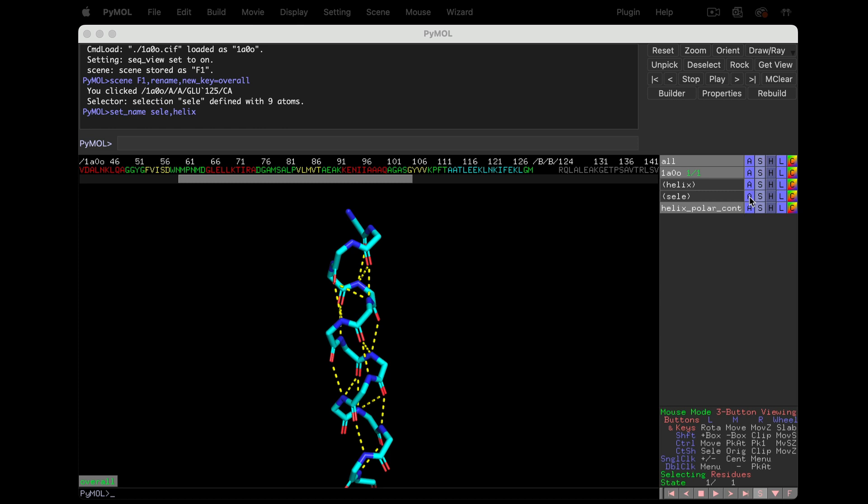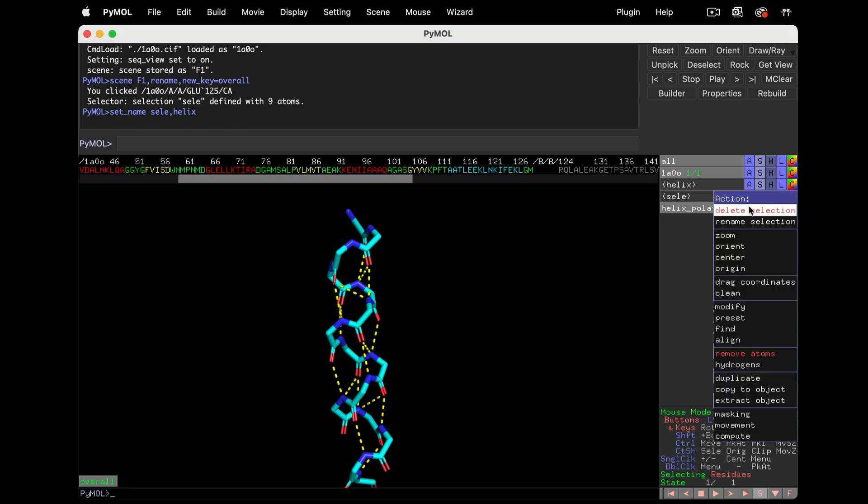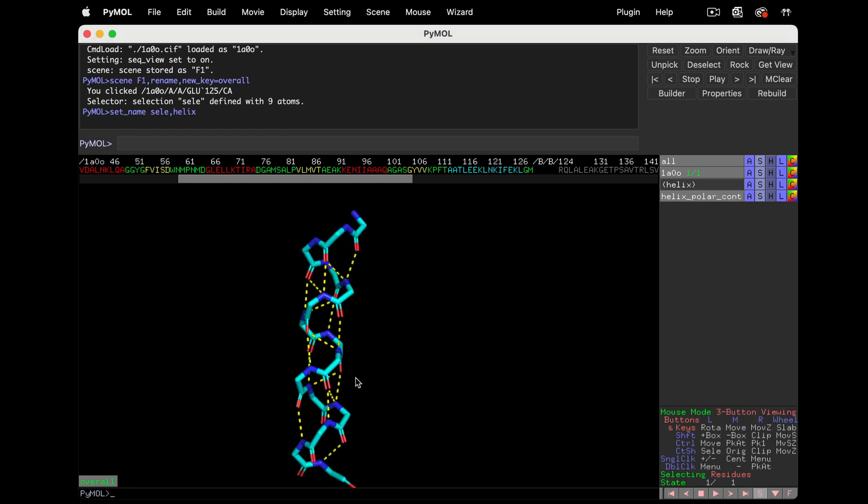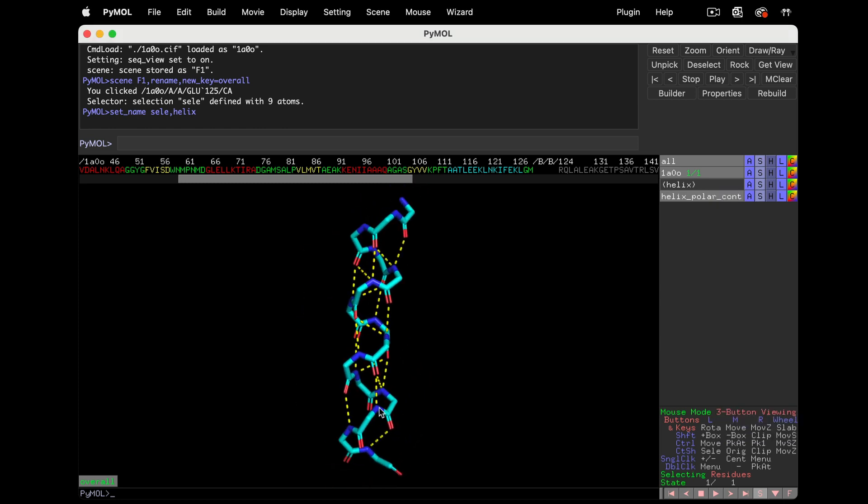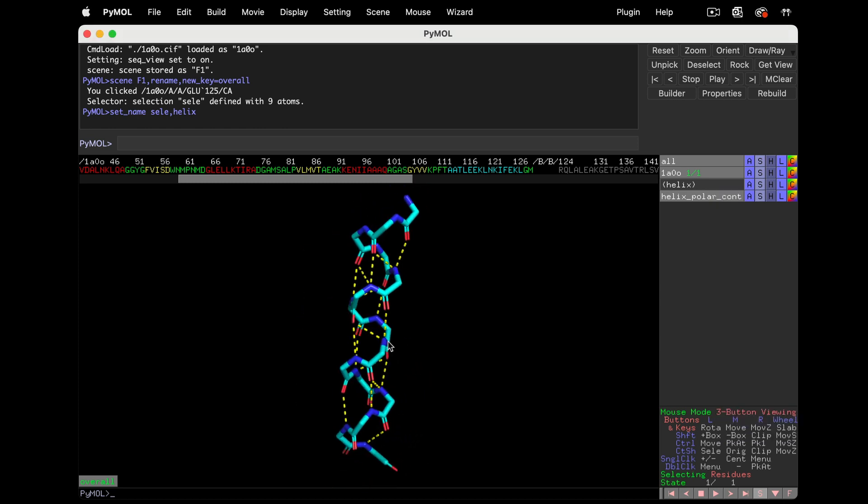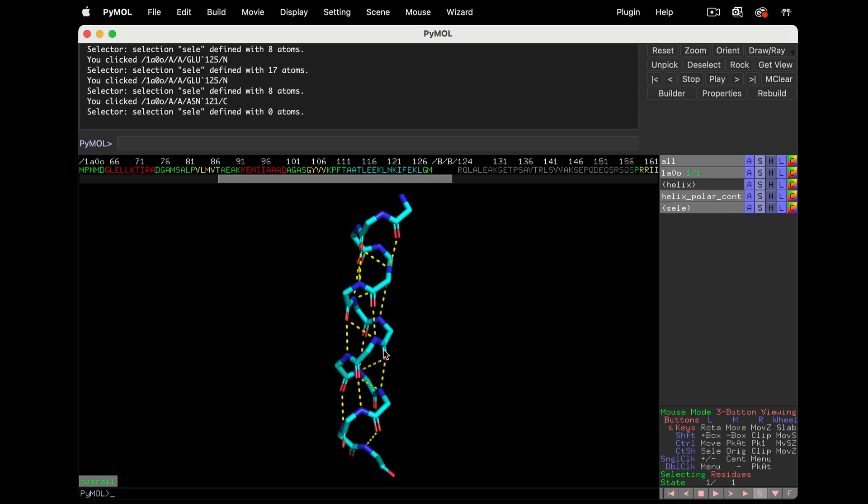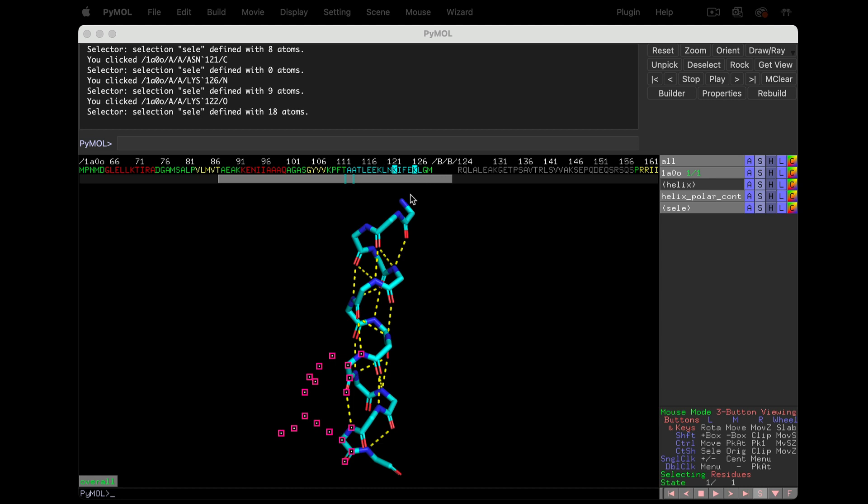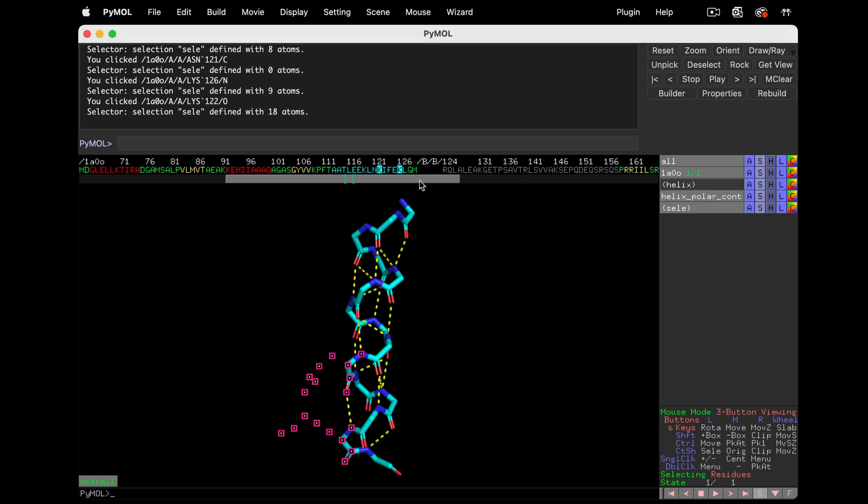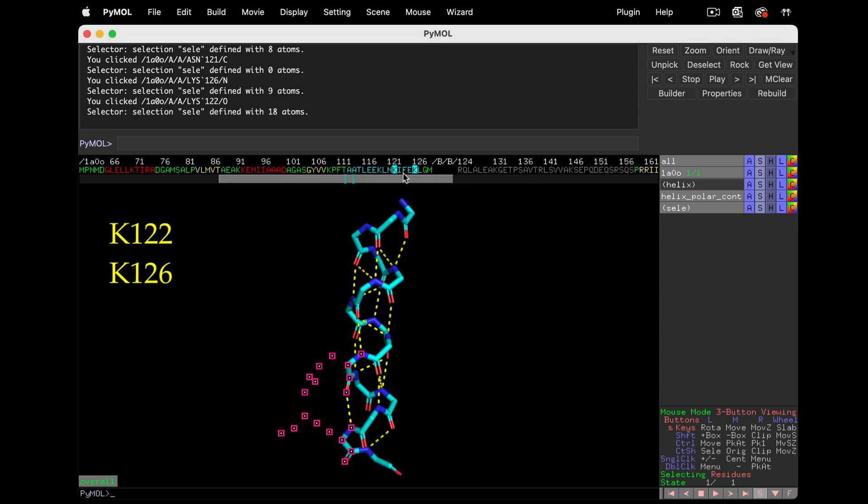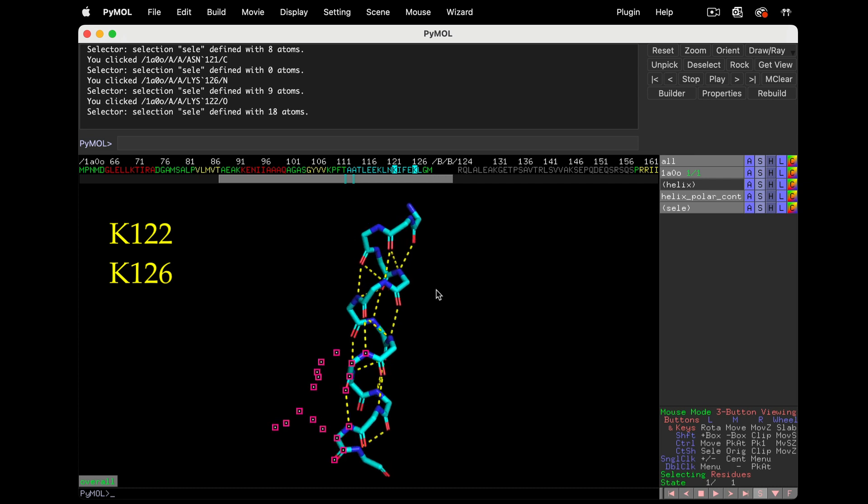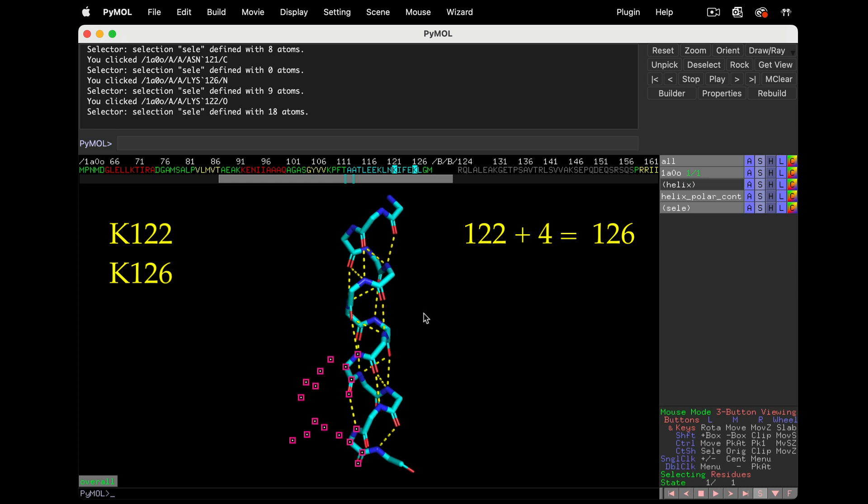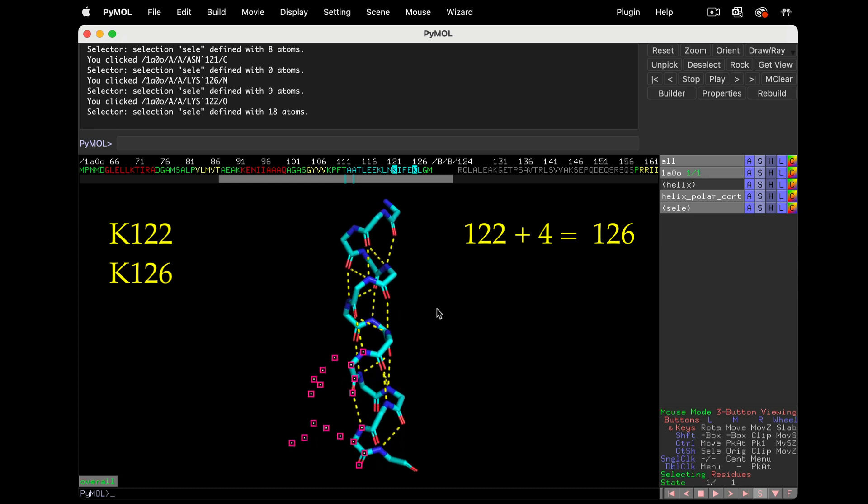Okay, that's better. Now let's analyze a residue making only one contact to determine the type of helix. Click on the two interacting atoms, and the residues will highlight in the sequence. It's K122 interacting with K126. 122 plus 4 is 126, so this is indeed an alpha helix.